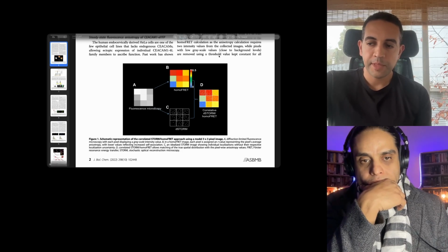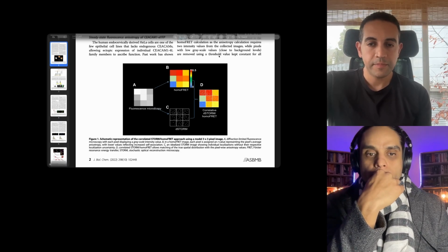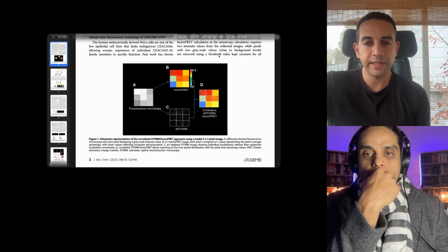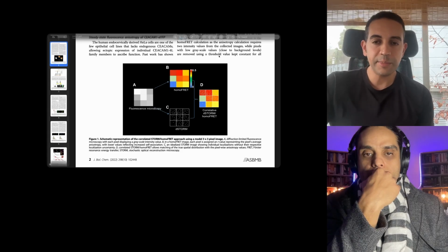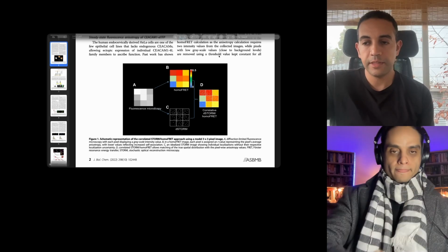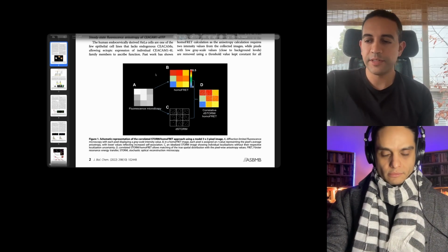So then, as you excite your sample with a selective type of polarization, the idea here is you're selectively exciting those fluorophores that have what they call their dipole moment aligned with the excitation light that you're using, whereas the depolarized one is going to come out differently. Okay. And don't ask me more because I need to rebrush my fundamentals there.